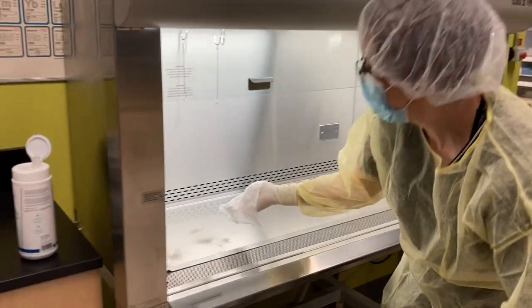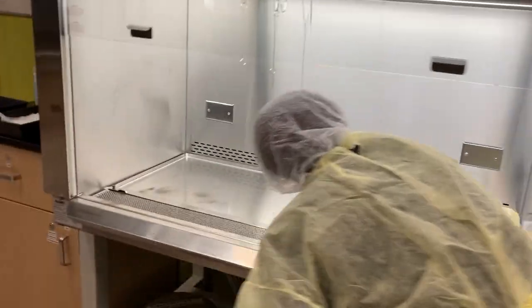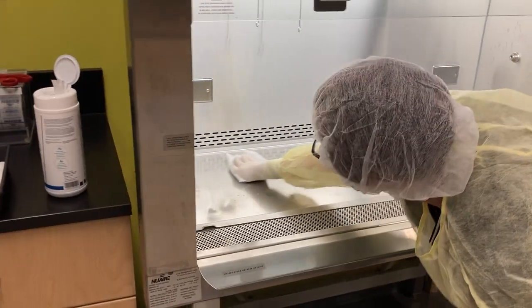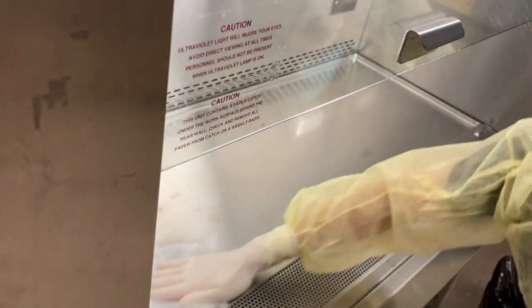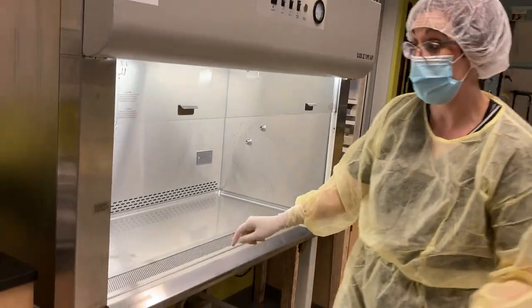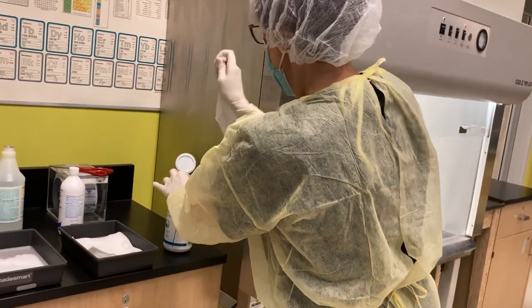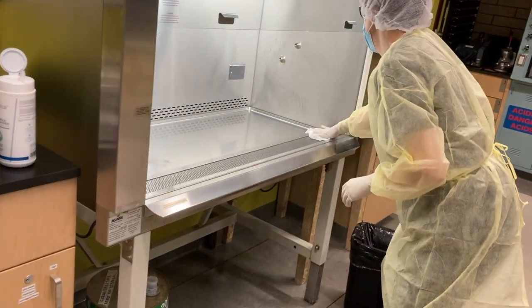Next, we're going to do the work surface. Using method A, you're going to work back to front, side to side, slightly overlapping strokes. Now this hood has a grill, so we're going to take another cloth and just wipe the grill from side to side.